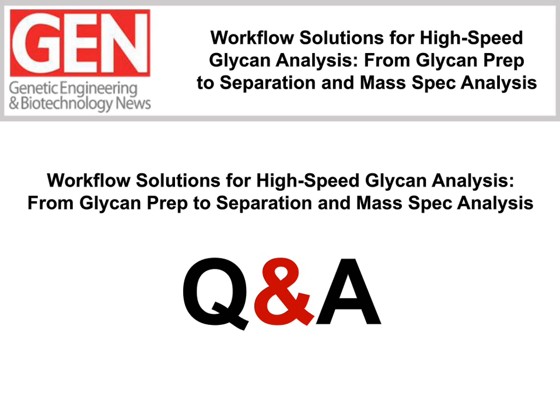Okay, and related question, the D-glycosylation and labeling process looks a bit complicated with many steps. Can this be done by users with little or no background in glycan sample prep? This really depends on how the reagents and supplies are purchased. With little background, I think you might be more inclined to purchase all-in-one protocols or packages. This would make things a lot easier. Going about procuring all these independently can be a bit time-consuming and challenging, trying to navigate through the different reagents and suppliers.